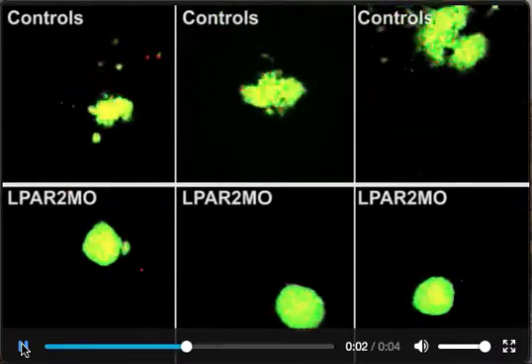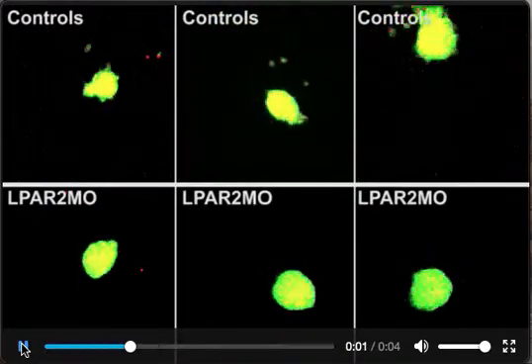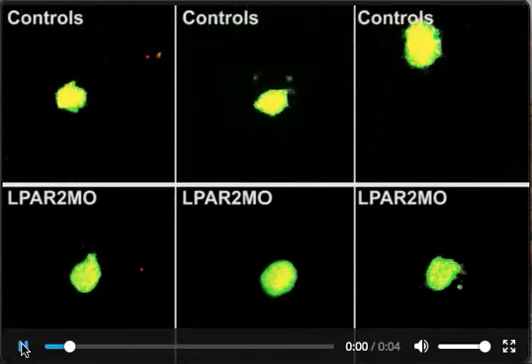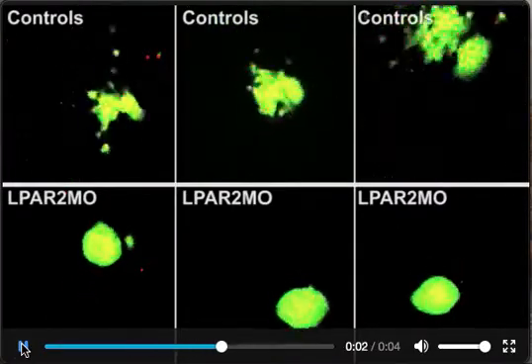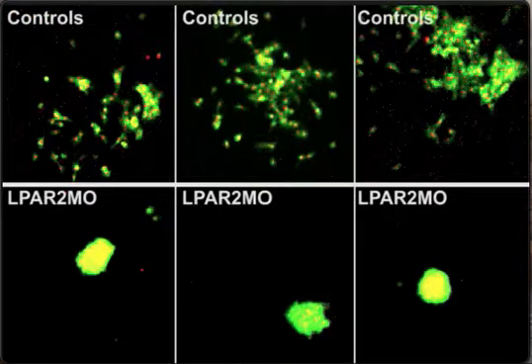And this is going to loop again. You can see them dispersing. So all of these controls up top here, these are just replicates, top and bottom. So the control cells, you can definitely see them dispersing. And now if we take a look at the bottom, and this dispersion that we see is a direct consequence of the loss of cell-to-cell adhesion, as you might expect.